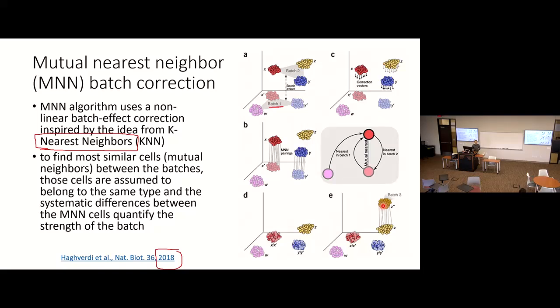This is very easy to understand, right? It's based on embedding. Again, this is one thing I don't understand, because you only move the cells, and the cells have been given coordinates in the embedding space.